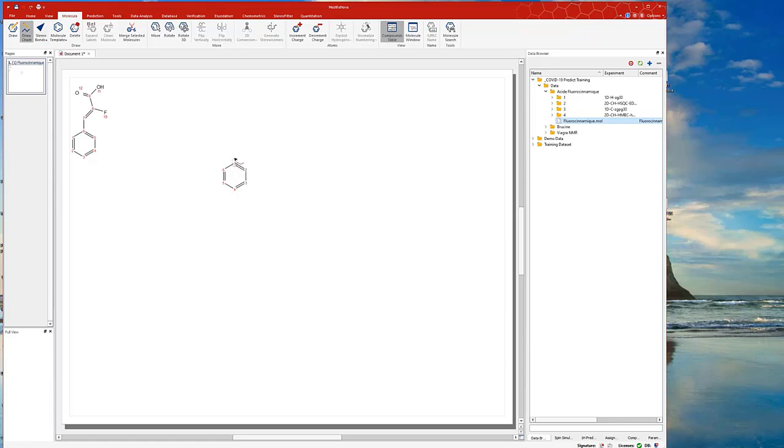Then you draw the chain, 1, 2, 3, 4, and click here. Add a double bond. Hover on it. Click to add oxygen here, another oxygen, and here click 1 time, and F. Then you have the structure. Very, very fast. Click escape to escape from the structure sketching mode. So you could either draw the structure or you can import from the mol file, as I showed you.